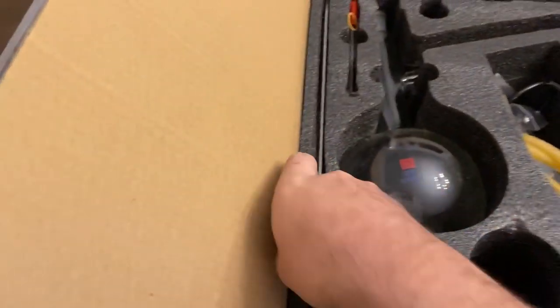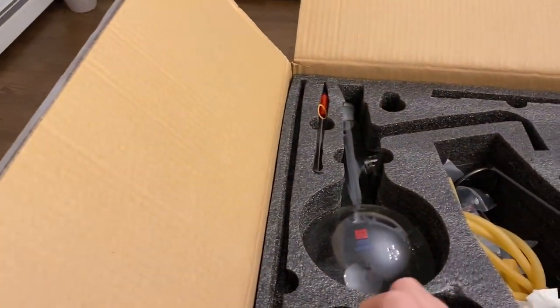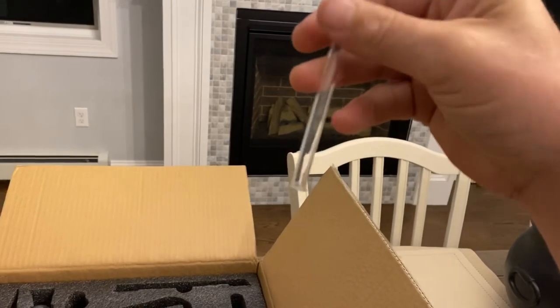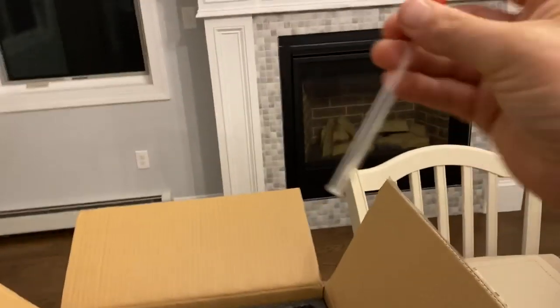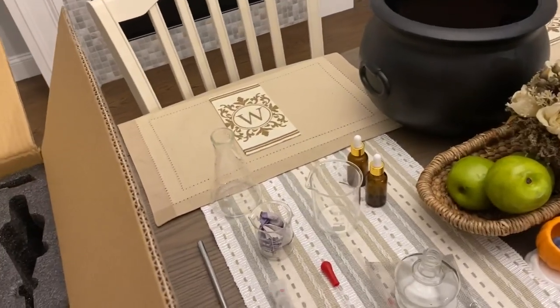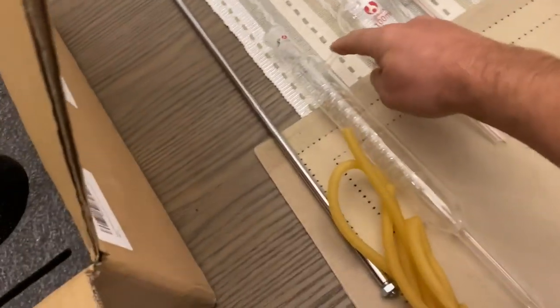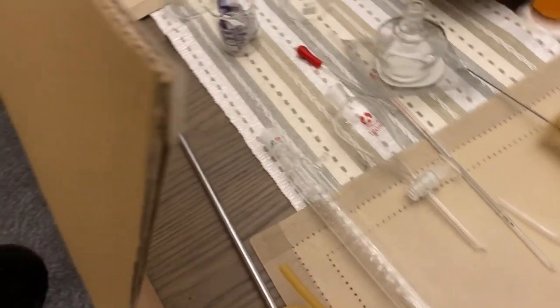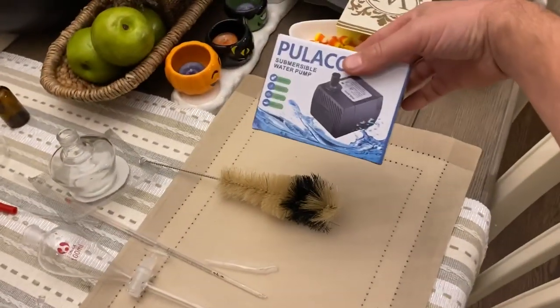You'll be left with the pure oil which you put into these droppers — the kit comes with two droppers. This is part of the stand system; it's a very heavy metal rod. There's a mixing flask — all solid glassware. This small piece goes on the other end and is a small dropper. This is the latex tubing which goes on here because you have to run cooling water through this: water goes in here and back down, and then the fluid goes through as a gas and condenses back down, kind of like a distillery.